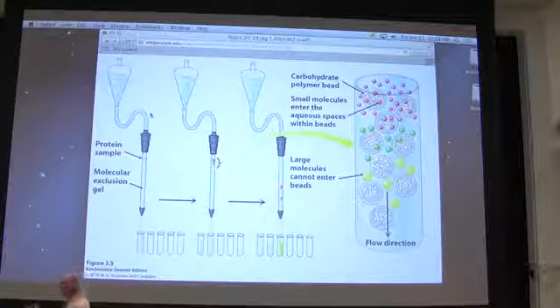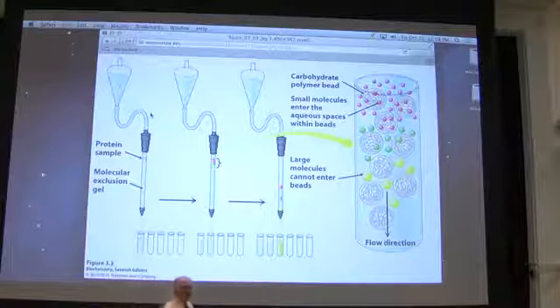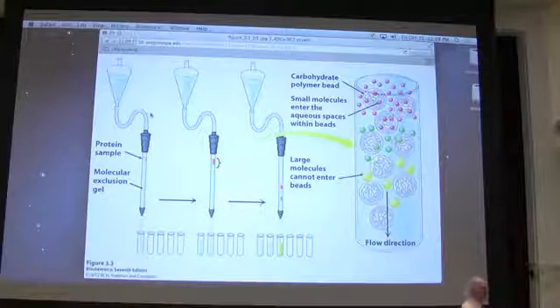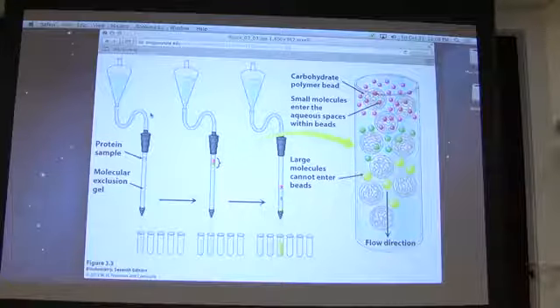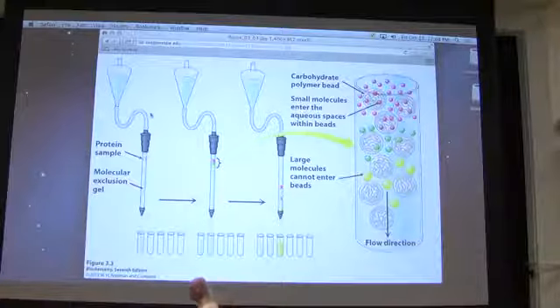Molecular exclusion, or gel filtration, and by the way, the word chromatography comes up. When I say gel filtration, chromatography, all the chromatography means is separation. Okay? So gel filtration, separation, molecular exclusion, separation. Okay? That's what those refer to. Now, these columns that I have here contain the material that allows the separation to occur. So as I said, I want to tell you a little bit about what these materials are.